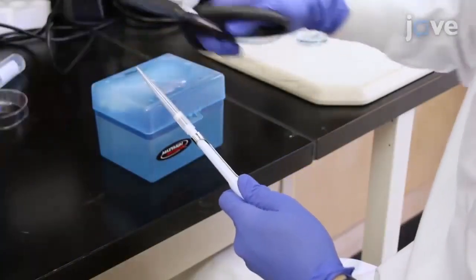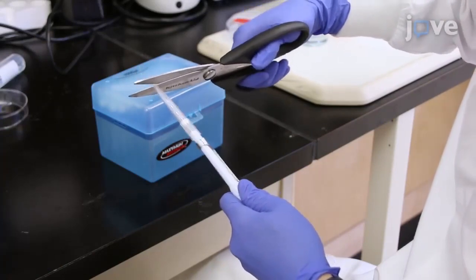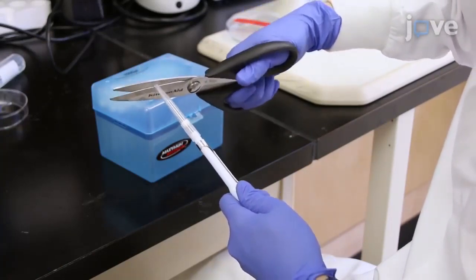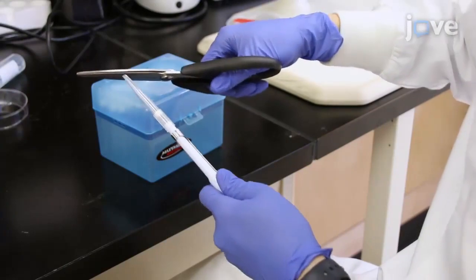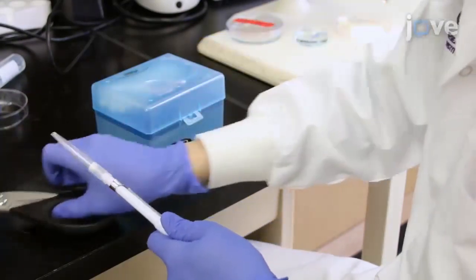Prepare a P1000 pipette tip for accommodating a 3 DPF larvae with minimal stress by cutting off the end of the pipette tip to a diameter of 2 mm.